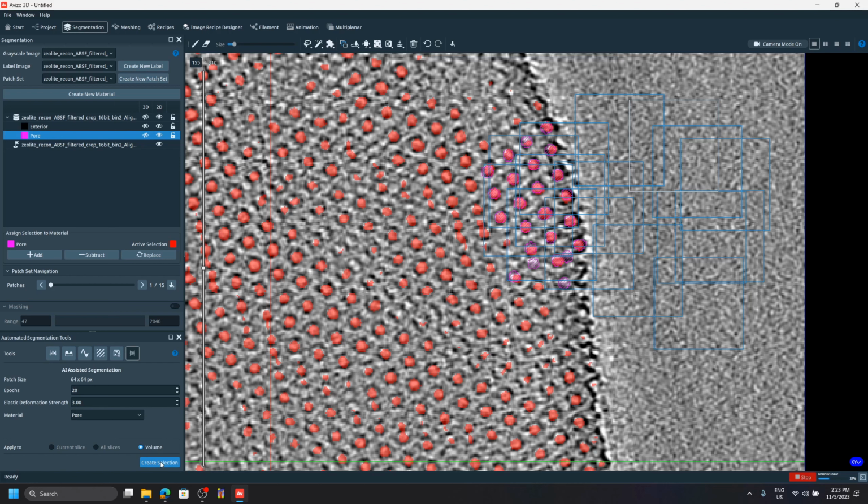It's required, actually, to take patches from regions without the object that you're trying to segment, because it needs to know that in these regions you don't find these objects, so I'm not going to detect them there. Exactly. So the more, the better, of course, but the more time you'll have to spend.